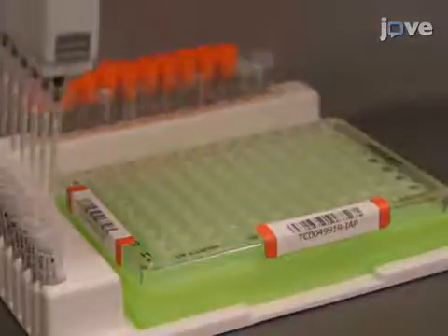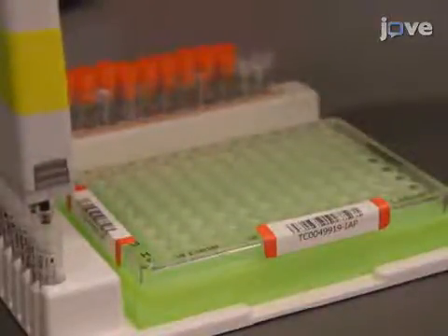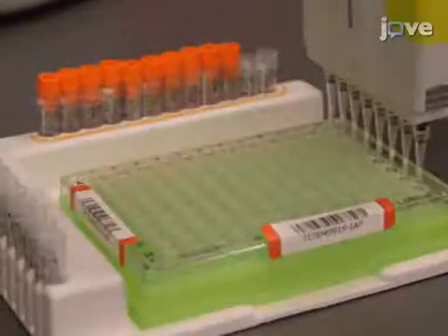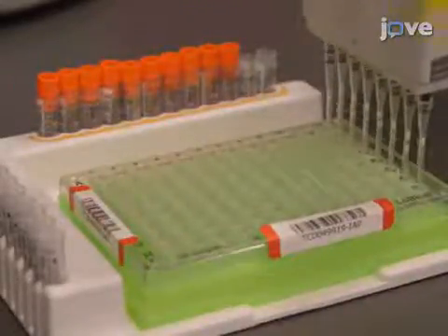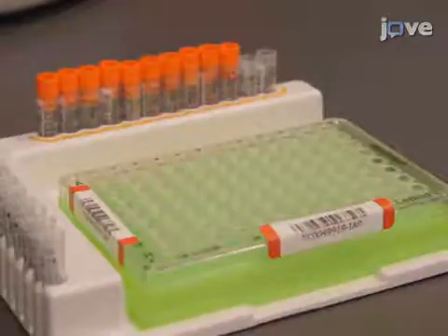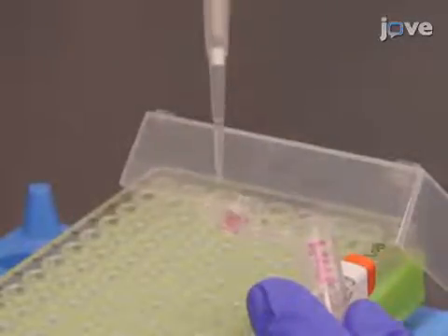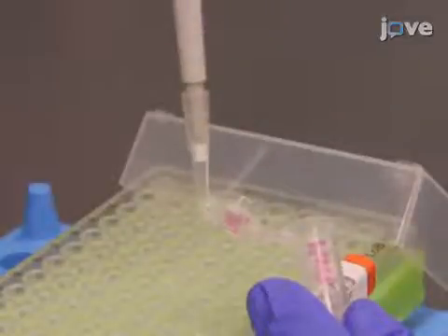To index the PCR amplification, arrange the primers in the index amplification plate, or IAP, fixture and aliquot the indexes being used into the corresponding wells in the plate. Then add 22 microliters of the PCR master mix to each well and pipette up and down three times.